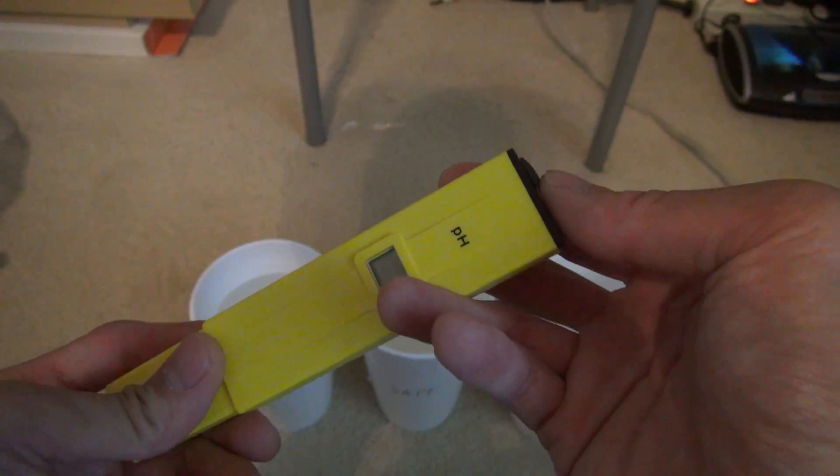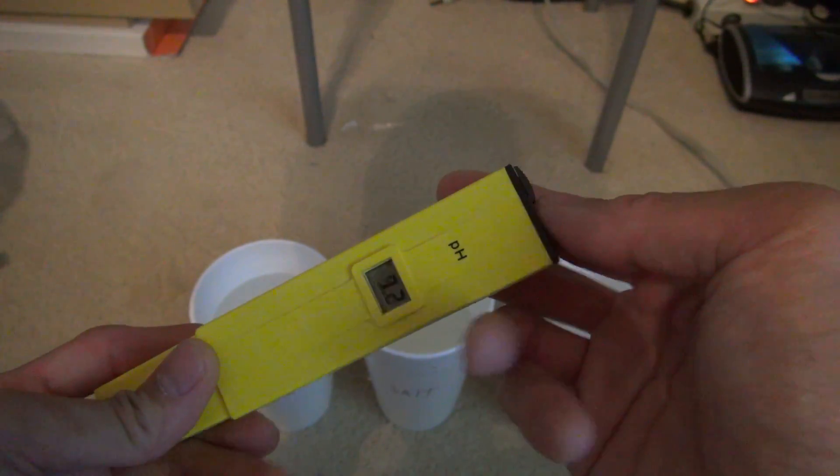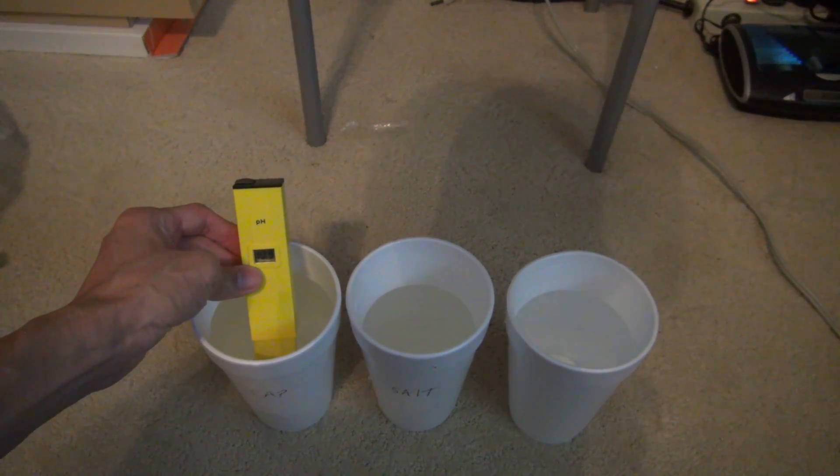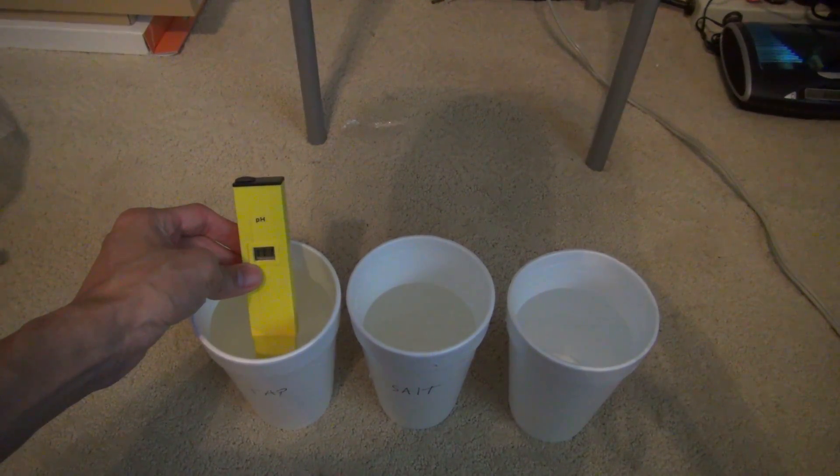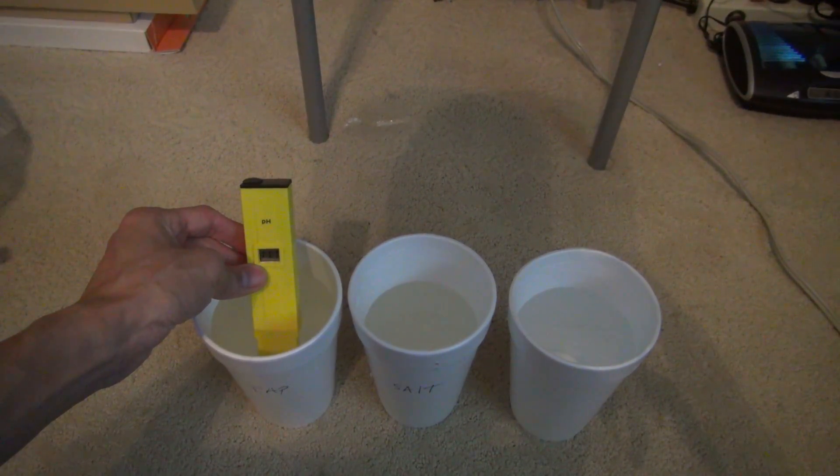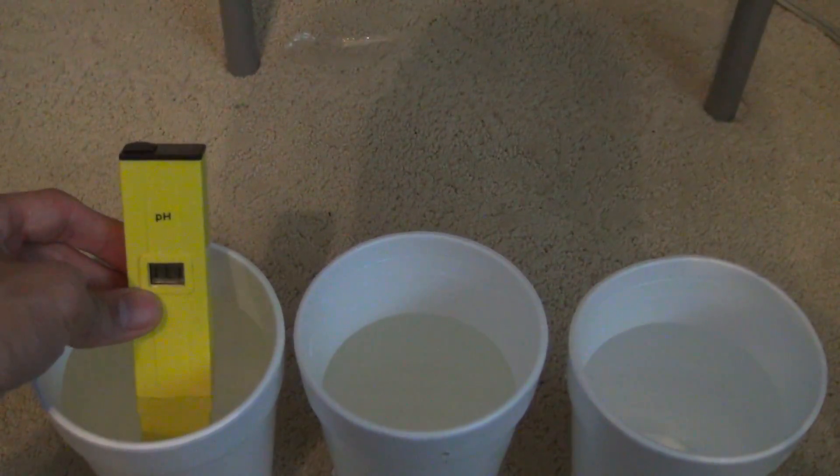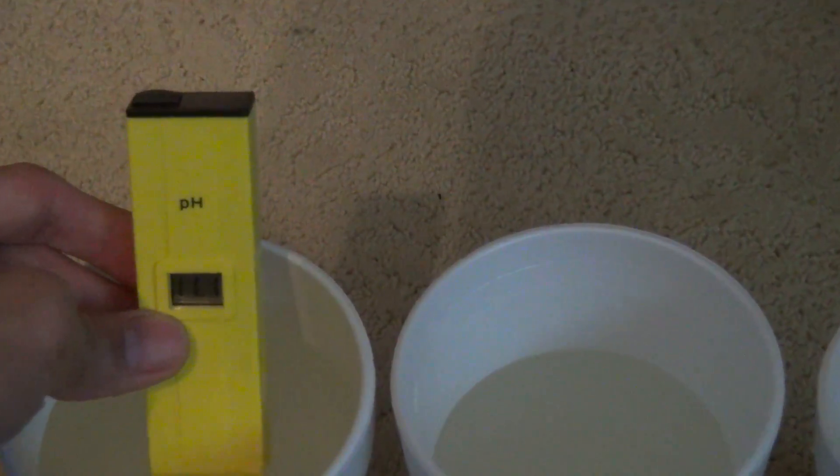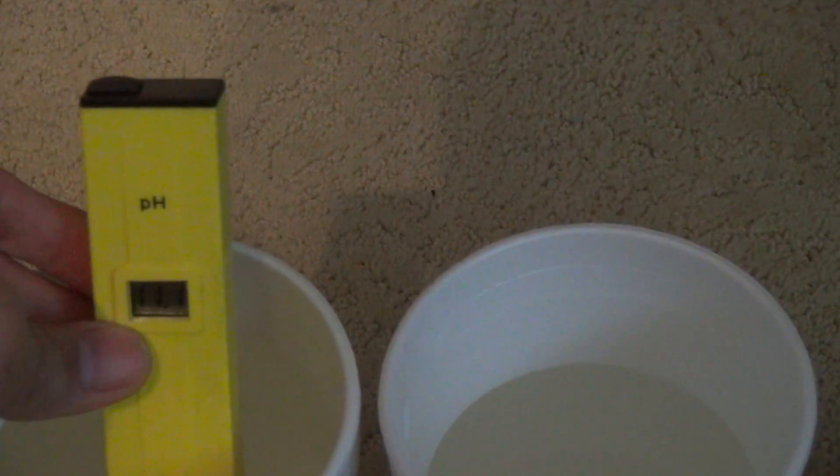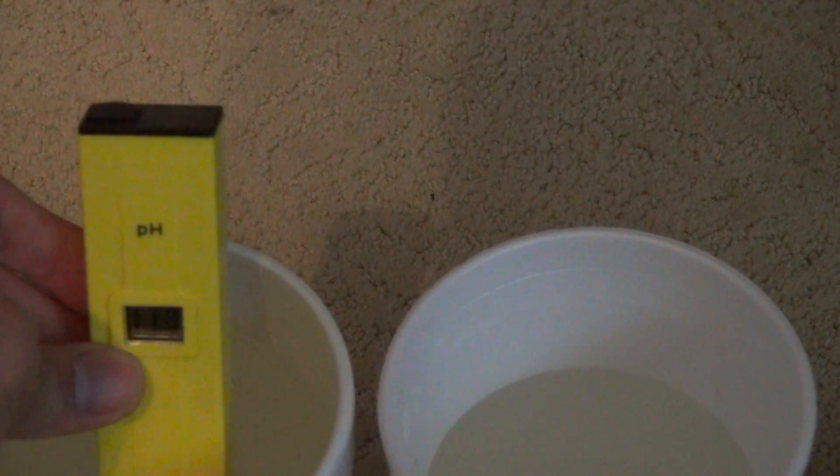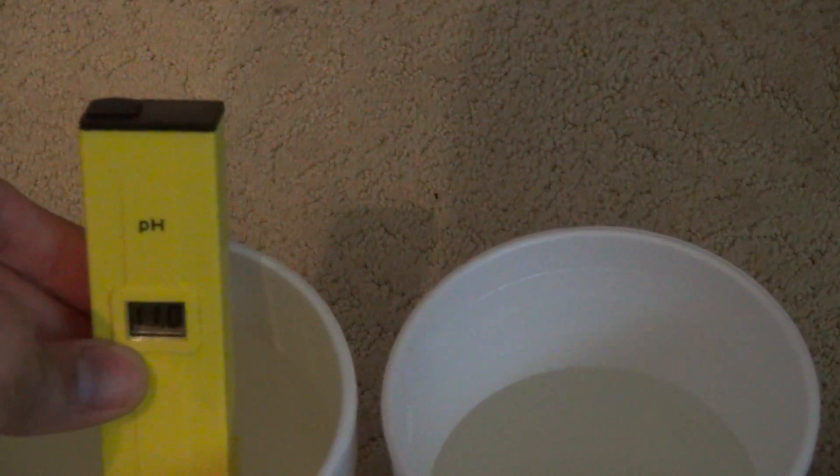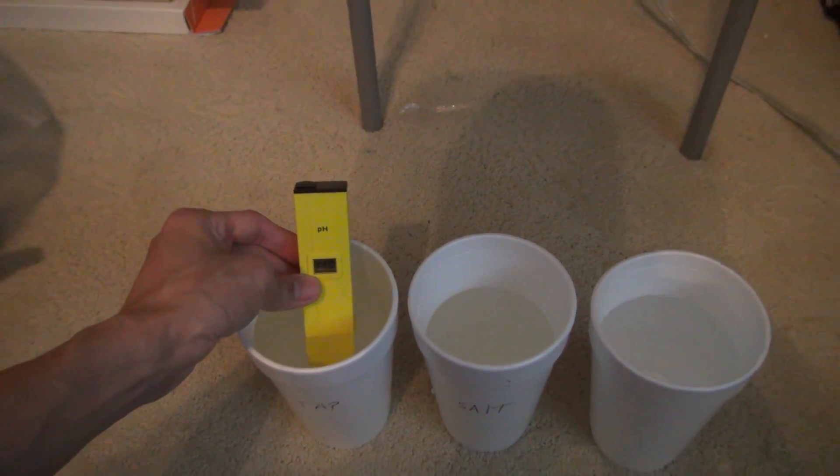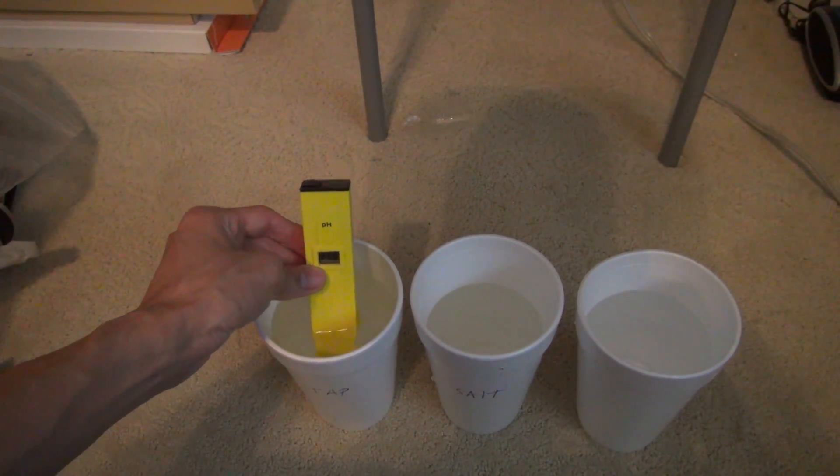I'm going to turn it on. This is tap water. In the middle is salt water.